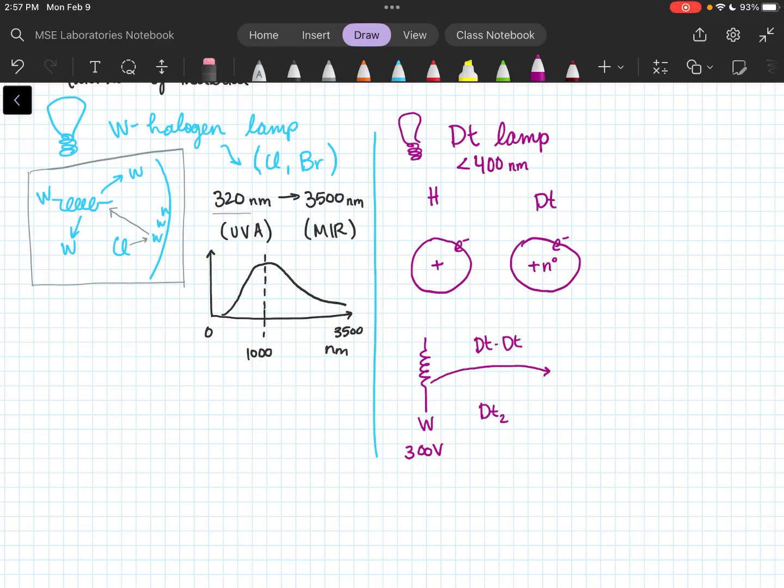Which causes an electron arc. So an electron flies off the tungsten, not dissimilar from the tungsten flying off in the tungsten halogen lamp. And that electron whacks a nickel anode, just a block of nickel.